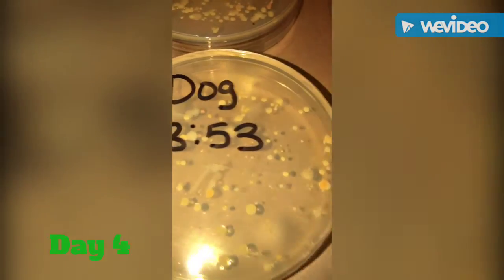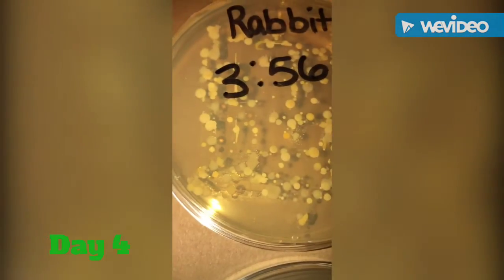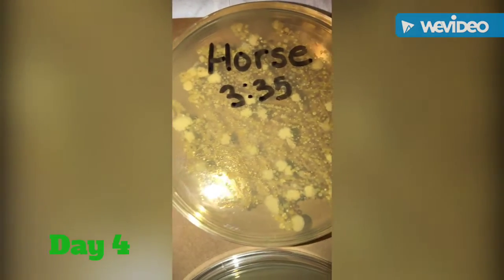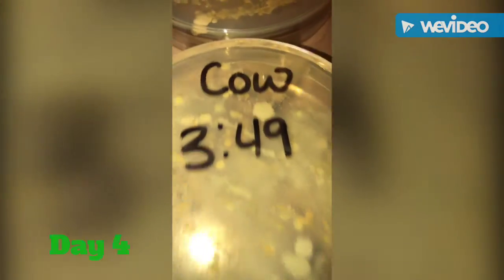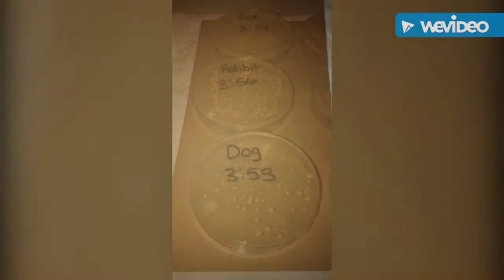Day 4. We have the dog, the rabbit, the cat, the horse, the goat, the cow, myself, and control. Day 5. My control is still clean.